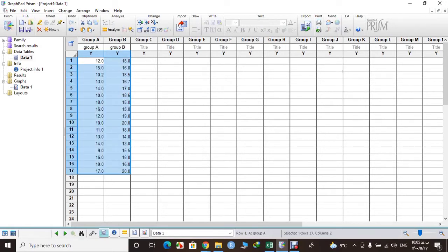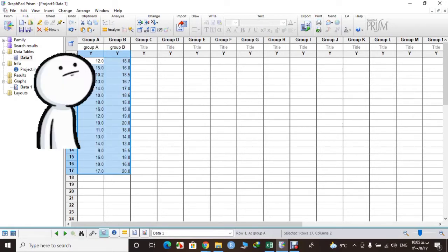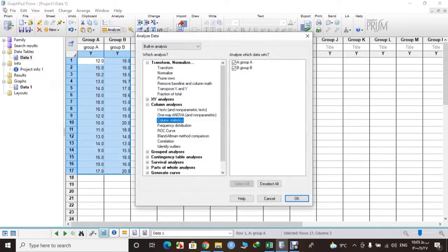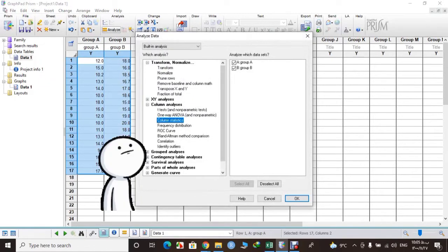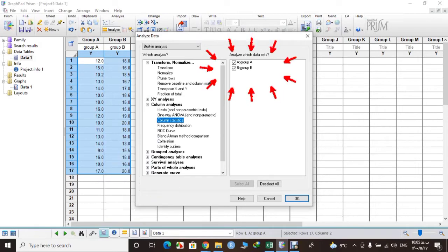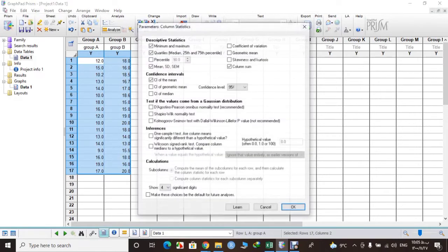Just like this, and then from the above tab select Analyze and then Column Statistics. We have group A and B here, and then okay.